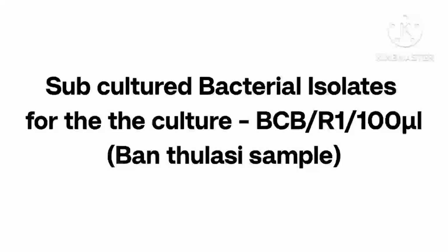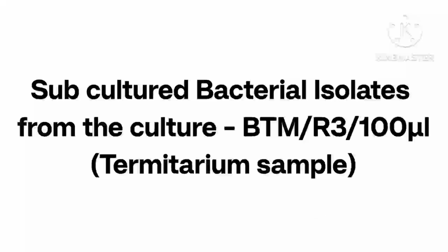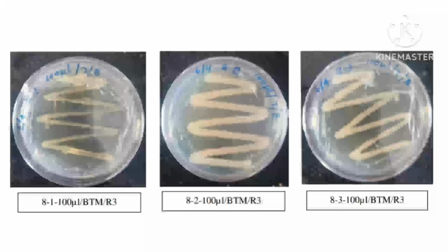Subcultured bacterial isolates from Bantholosi sample. Subcultured bacterial isolates from replication 1 under 100 microliter dilution. Subcultured bacterial isolates from termitarium sample. Subcultured bacterial isolates from replication 3 under 100 microliter dilution.